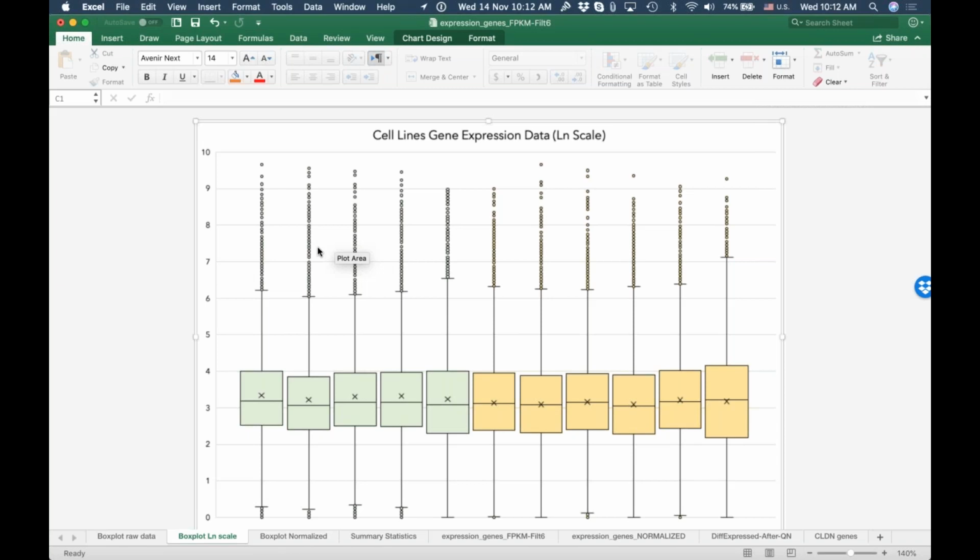And if the mean is different between the two groups because of this technical difference, then we will expect some influence of it on our ability to statistically estimate the value of the difference. And so we will see the impact. We will actually get more differentially expressed genes than really exist in the sample.